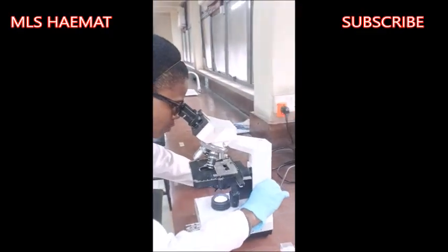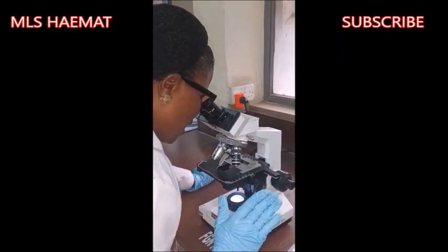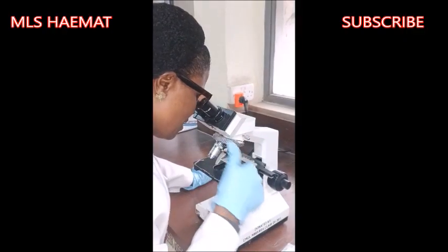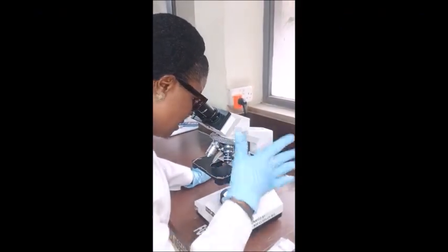Just turn the coarse adjustment. As you are turning it, the stage will be going up. And now, with the ×4 objective lens, I already have the red blood cells in focus. I can see them, they're all over the place.